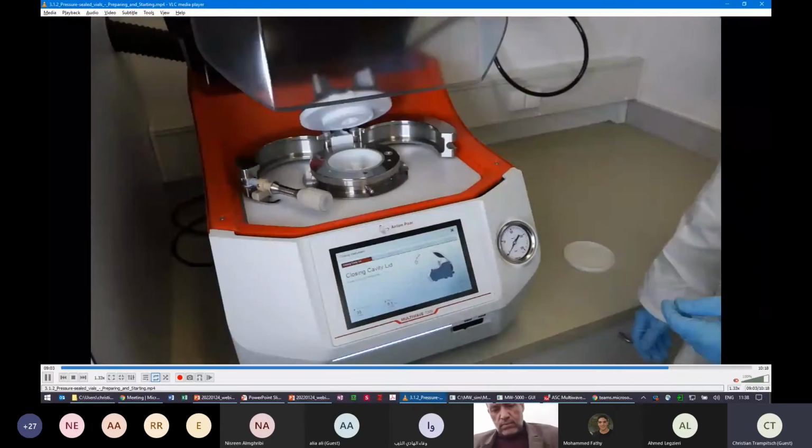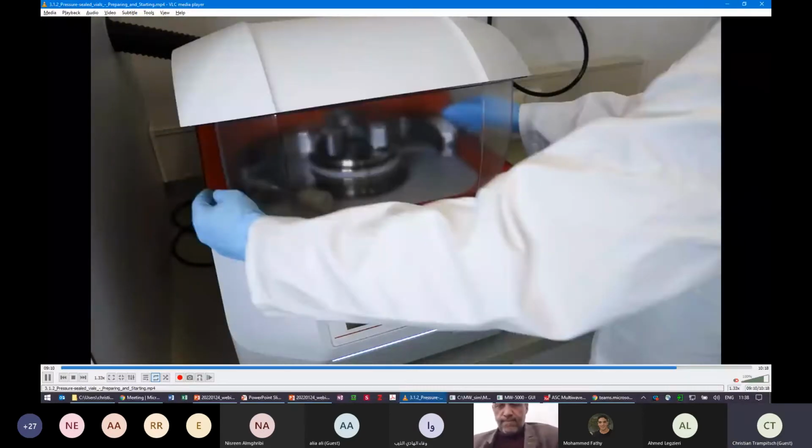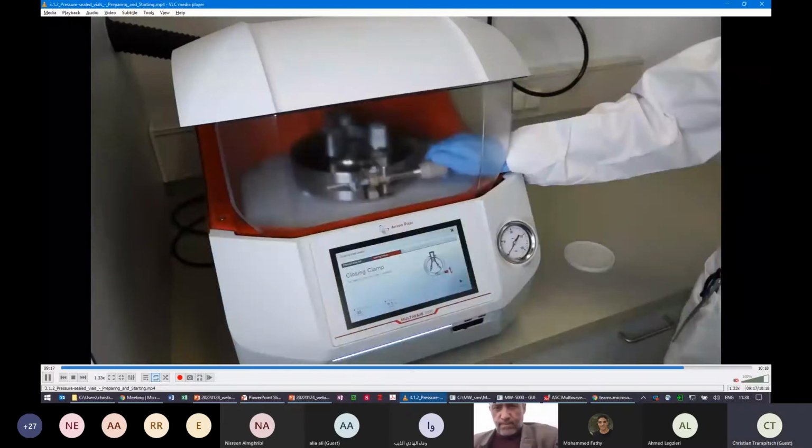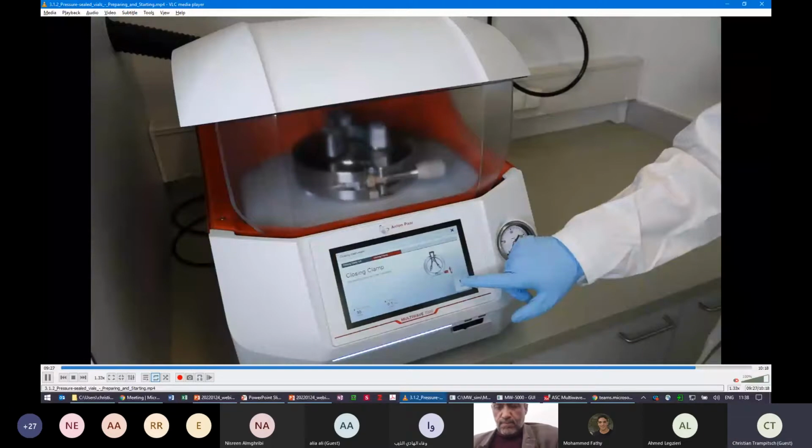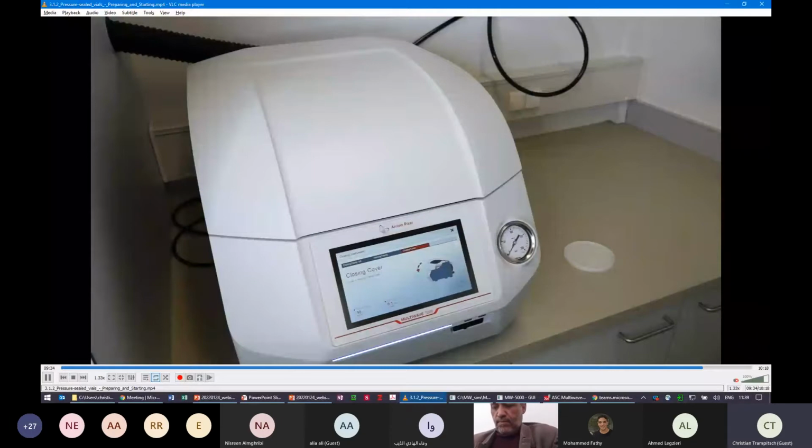It's closing, it's putting the lid on the autoclave. We then close the screws here. We don't have to apply huge force, so this is very easy to do. Just close it. Tell the software that we finished. The instrument will lock the cover and we start to pressurize. We start with 40 bar, usually by default. Then the instrument automatically takes the desired pressure, fills up to 40, or in that case, it was obviously 50 bar. The run is starting, and that's it.